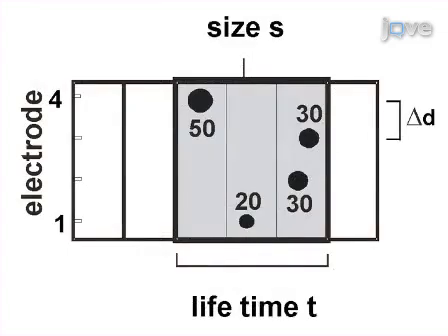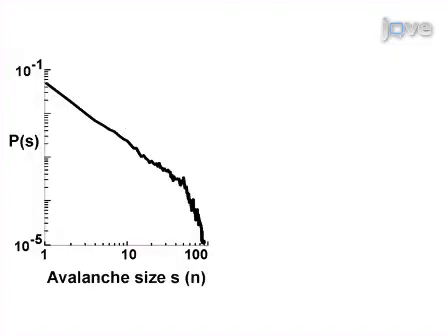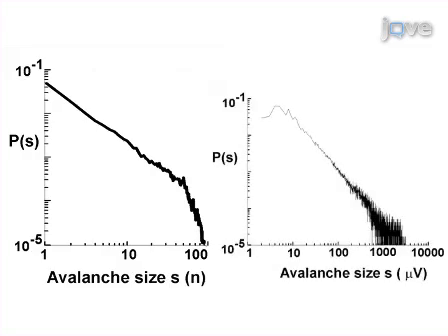The emergence of spatiotemporal NLFP clusters is highly organized in cortical networks. More specifically, the organization is scale invariant for neuronal avalanches. This is demonstrated by calculating the probability of cluster sizes at a given temporal resolution, delta t. Here, clusters are composed of NLFPs that occur in the same or successive time bins. When the size of such a cluster is expressed in total number of NLFPs per cluster, or integrated NLFP amplitudes per cluster, the cluster size distribution reveals a power law with an exponent close to -1.5.